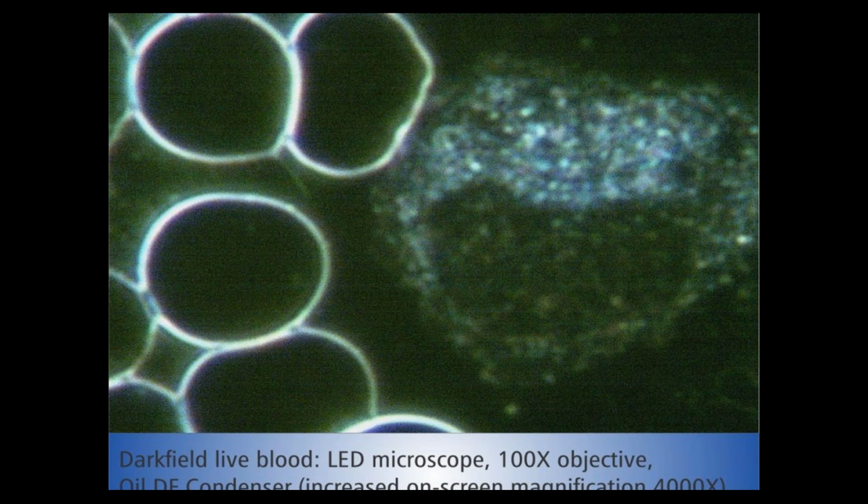Mm-hmm. So being able to show clients a live video feed of their blood on screen is really central to live blood analysis. And this is of course achieved by attaching a camera to the microscope. Now I've seen microscopes that have cameras attached as an eyepiece, but the recommended way is to have a separate camera tube in the microscope. Could you tell us a little bit more about that, please?